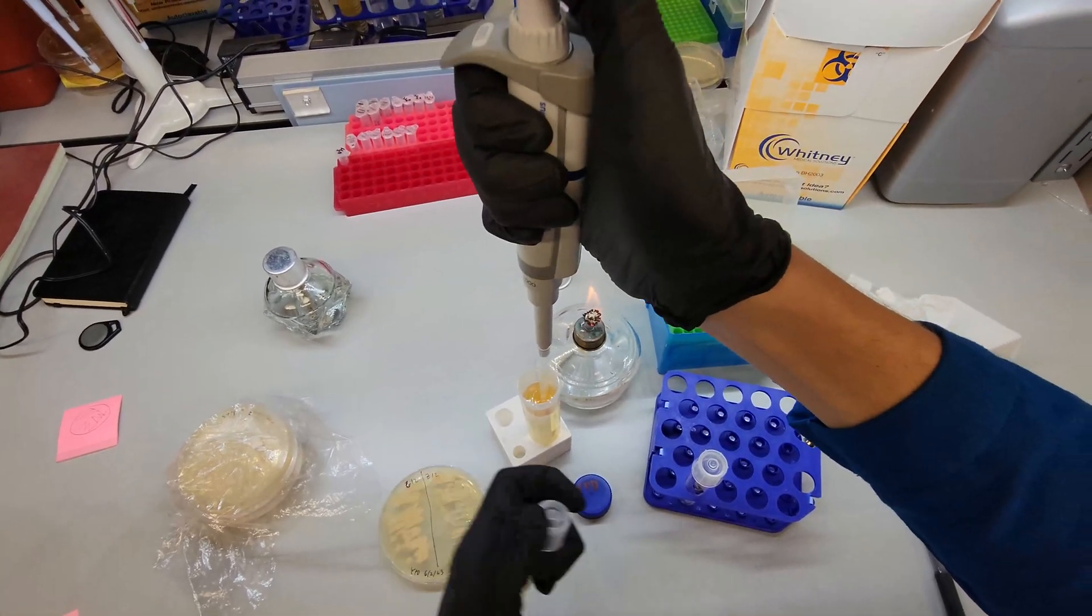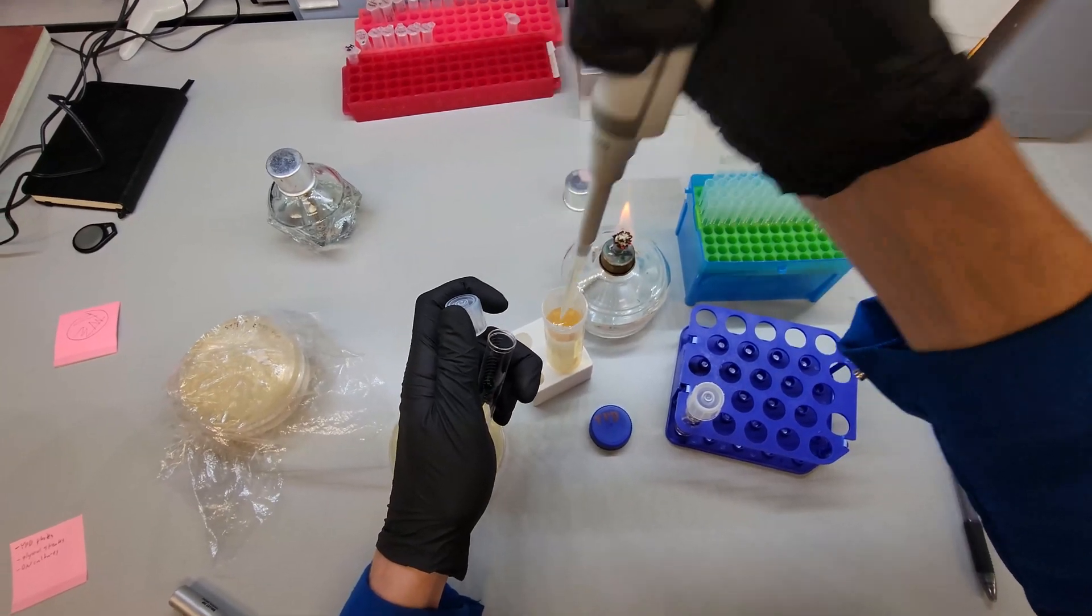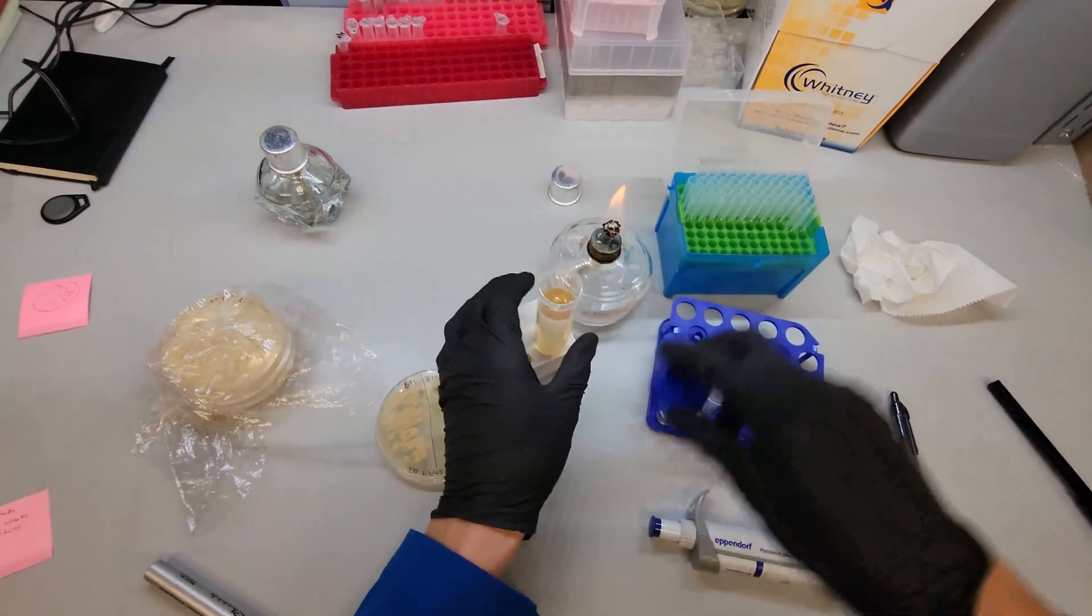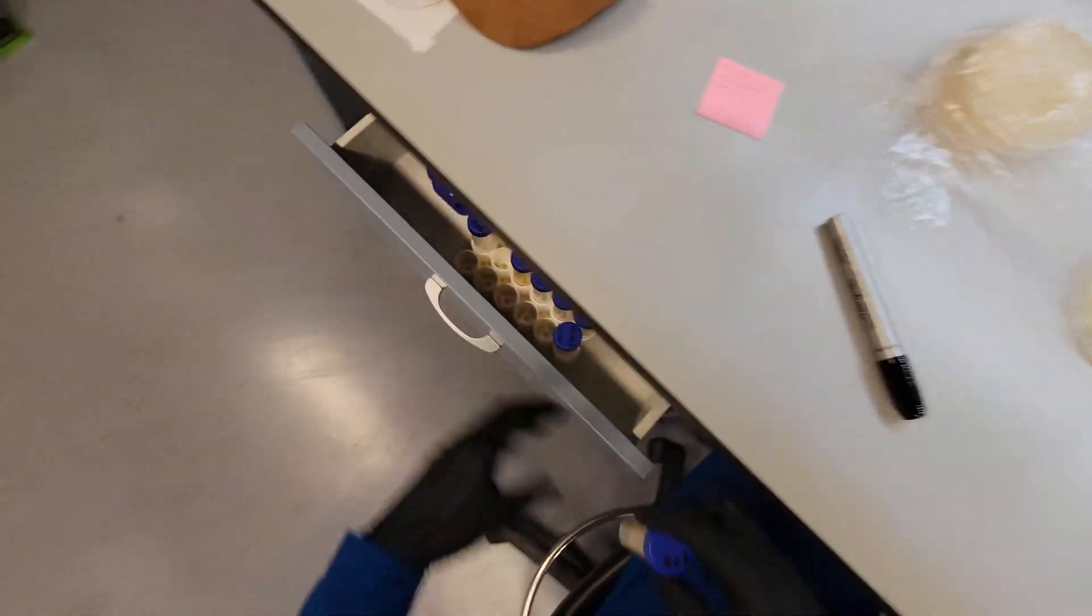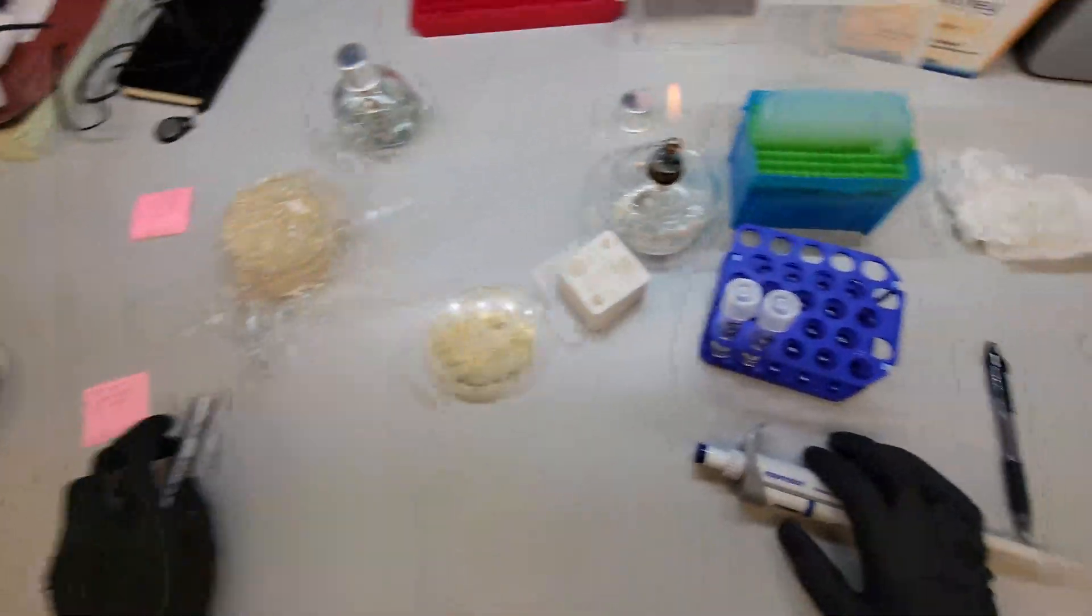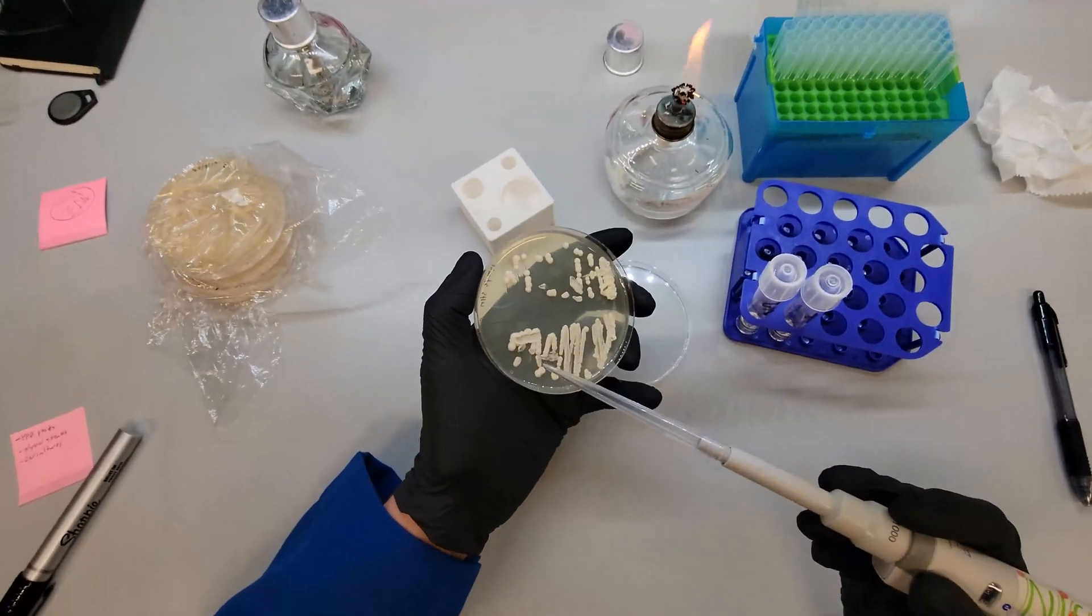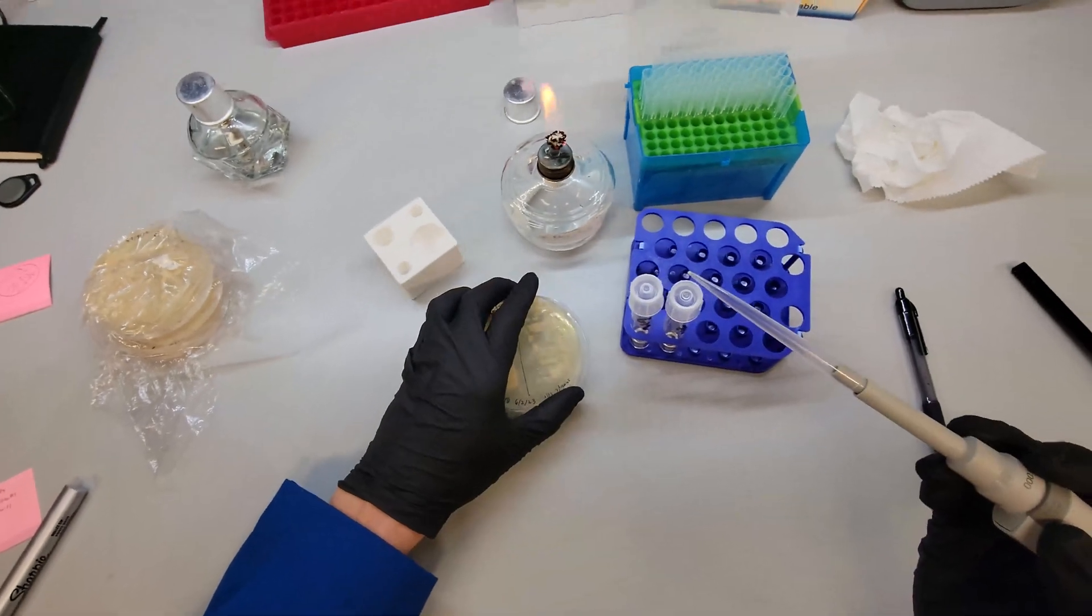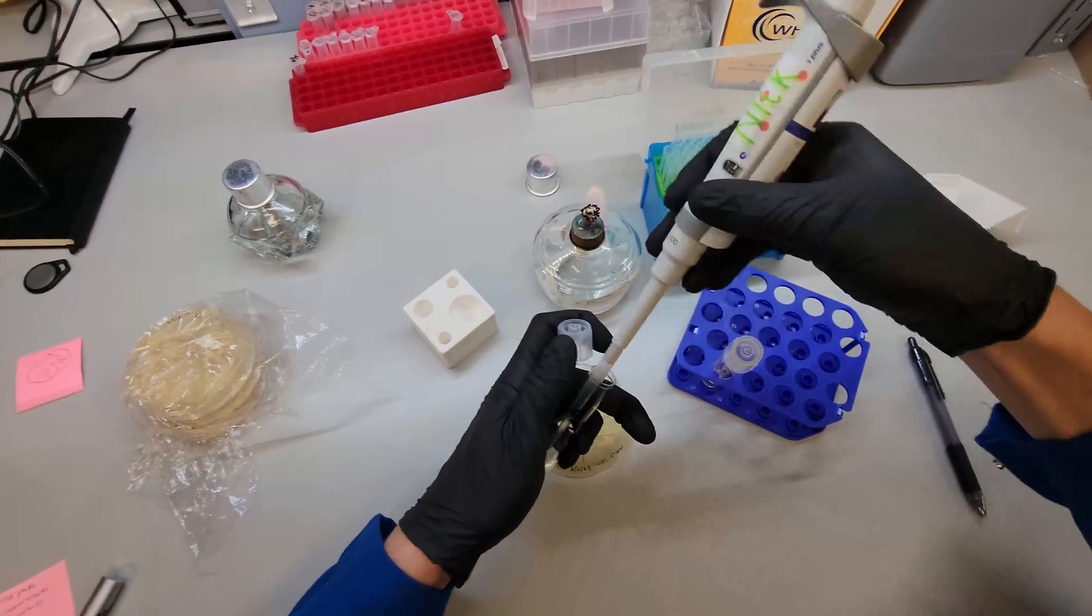Probably not best to talk while you're working with sterile things because you'll spit all over everything and get contamination, but whatever. I'll flame the lid just a tiny bit, put the YPD away. It's a super easy process. The only difficult thing is you need to maintain sterility. If you're really concerned about sterility, you can make one tube that you don't inoculate and then you can be pretty sure that you didn't get any contamination.